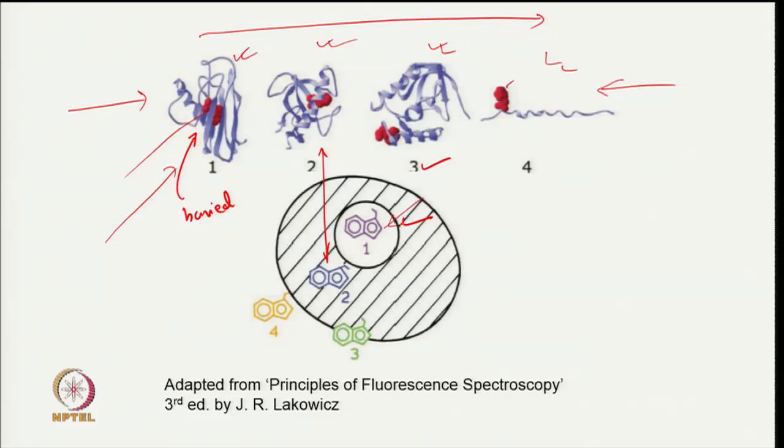When it is in the second state, you can think of it as being here, and in the third conformation, it is at this position, and when tryptophan is completely exposed in the protein, then it is basically in water.